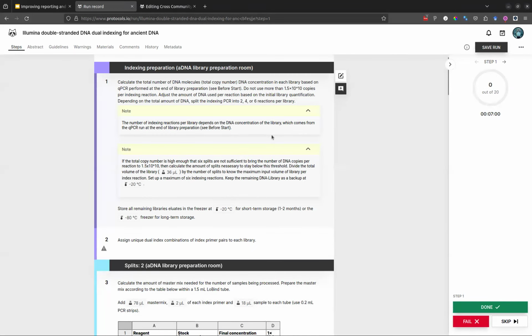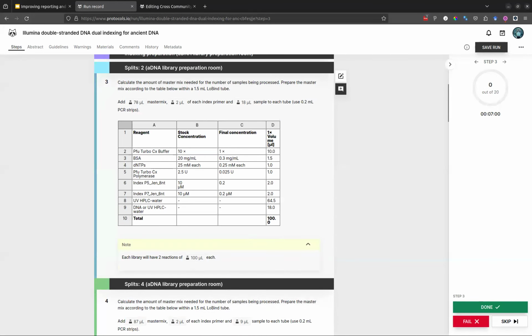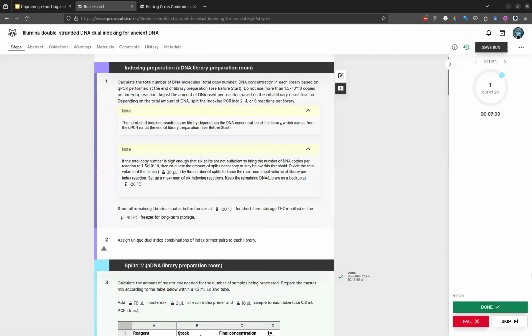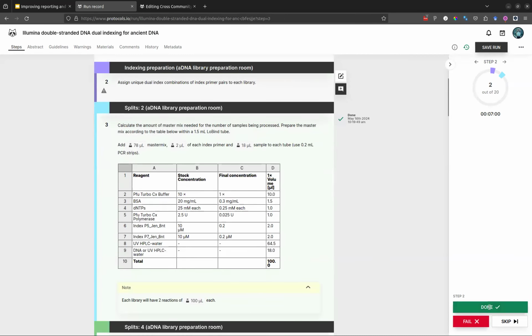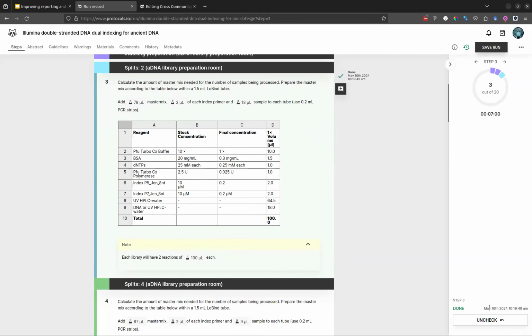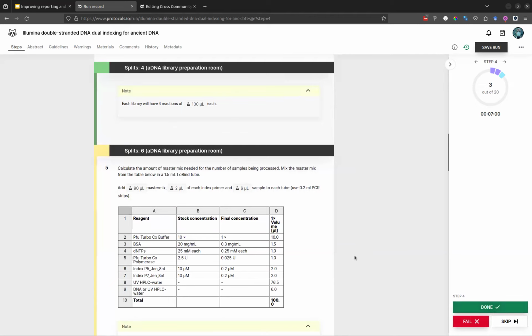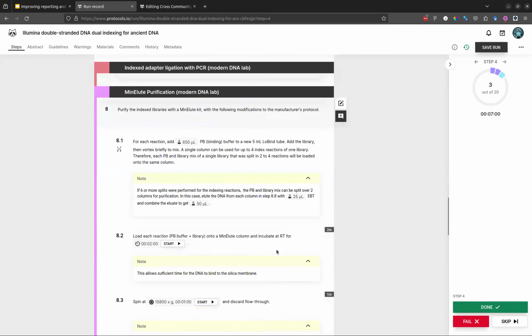I don't know why this is not working now. Or is this one second? There we go. Sorry, the Zoom bar was covering it as a hidden thing. Going back, but you can see that basically it's done with step 1, step 2. On the right-hand side, you see the progress bar is going forward. Then step 4.